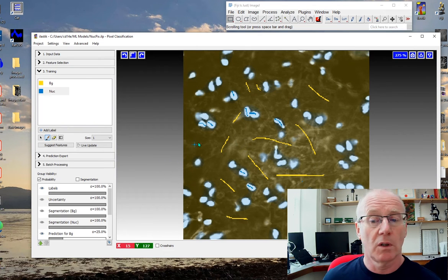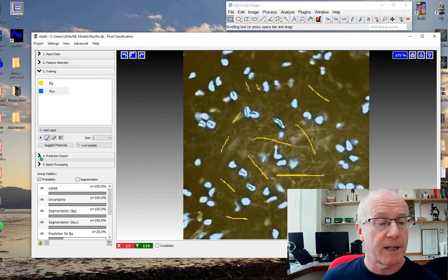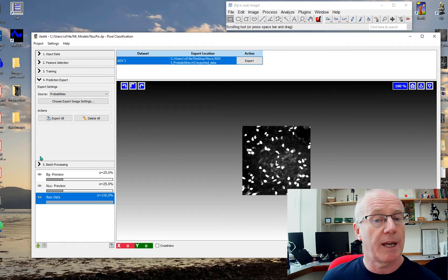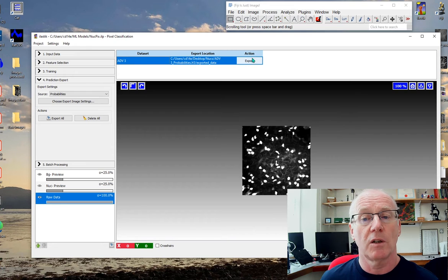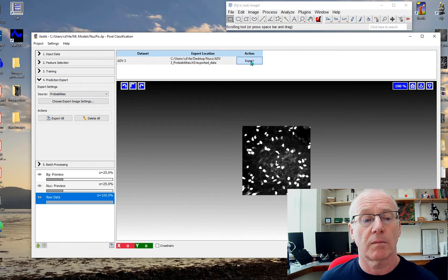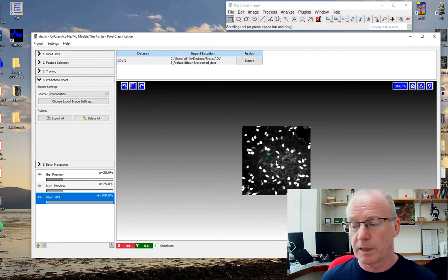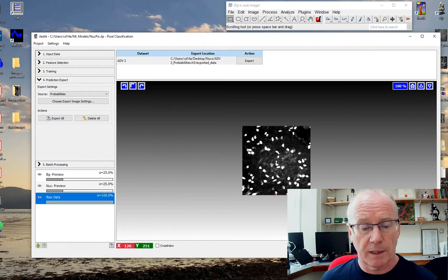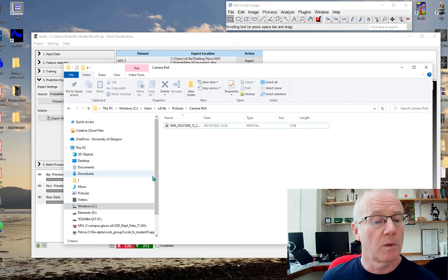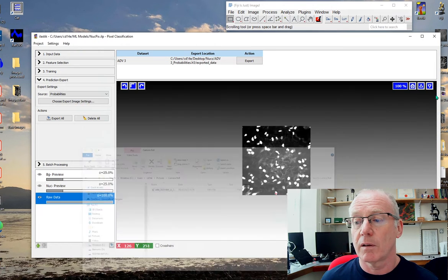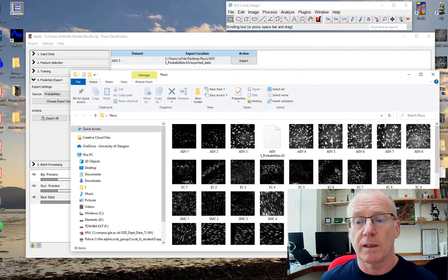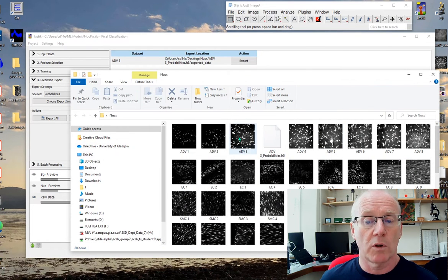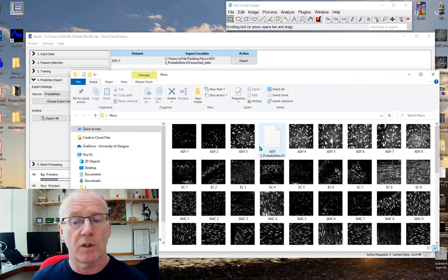That's more or less it. If we go to the prediction export now, we will export the result. If I go to my window where I have the nuclei, here's the result. It was ADV image 3 and here is the result.